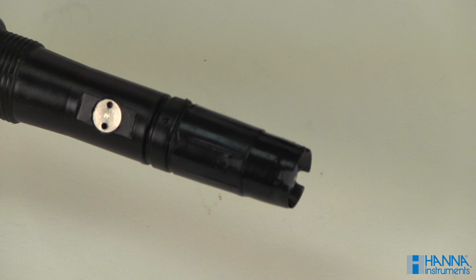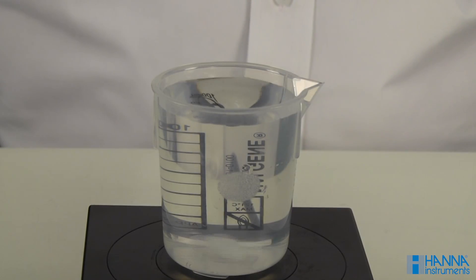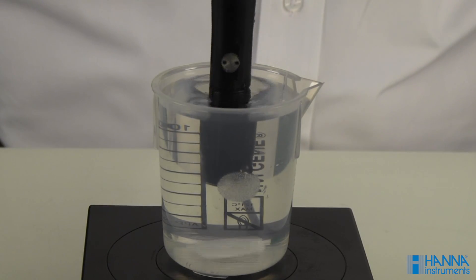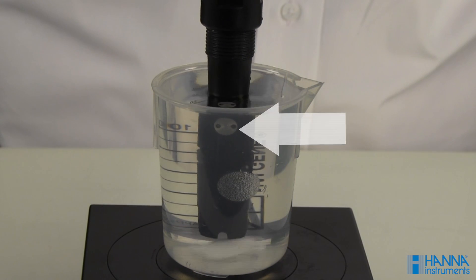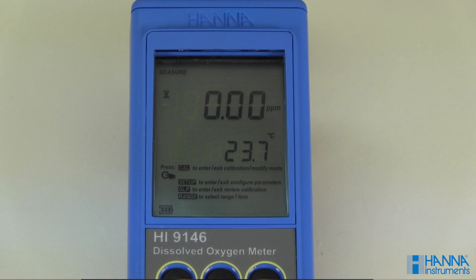Remove the protective cap. Submerge the probe in the zero oxygen solution and stir gently for a couple of minutes. Stirring your solution when calibrating and measuring is important to ensure accurate readings. Make sure the temperature sensor is submerged as well. This is essential.